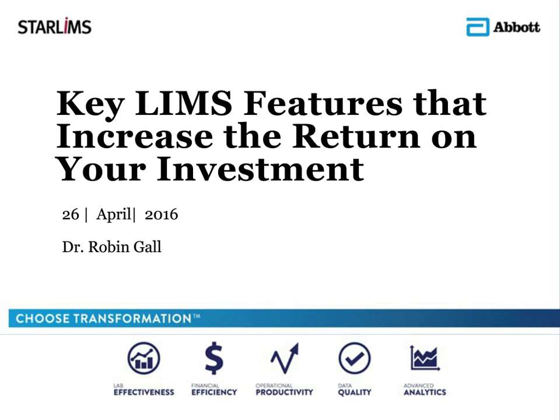Thank you, Trevor. Today I'm going to be talking about LIMS, Laboratory Information Management Systems. And as my co-presenters have shown us this morning, a laboratory generates a lot of information and a lot of data. And laboratories need a mechanism and an automated system and an electronic system to manage all of this data that's being generated.